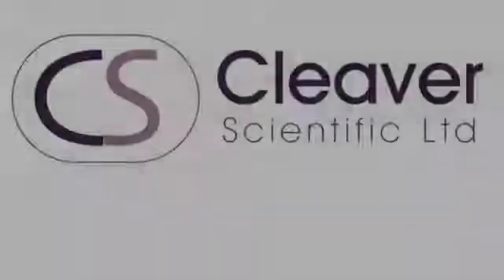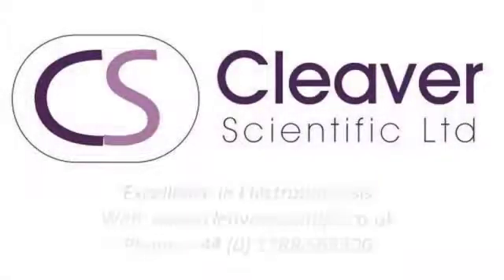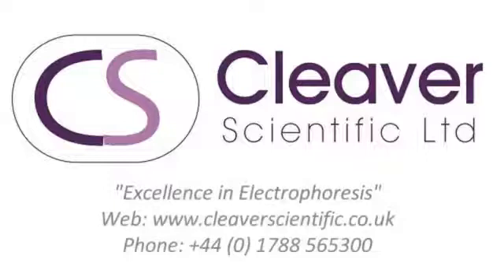For more information about the omnipage vertical electrophoresis systems from Cleaver Scientific, please visit their website or call them directly.